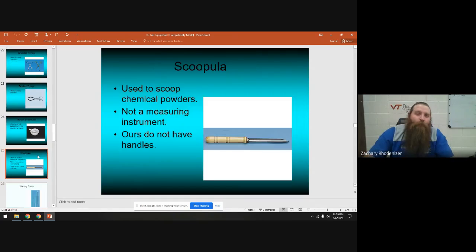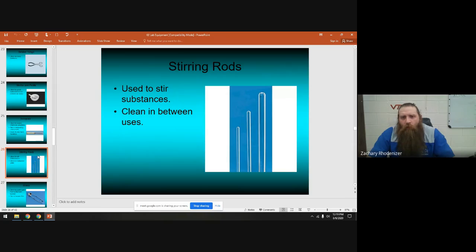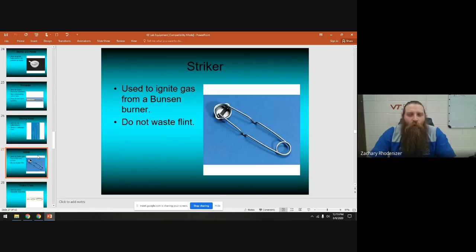This is called a spatula — most of ours are missing the wooden handles so they just look like metal scoops. You use them to get chemicals out of containers into a weigh boat. Everybody in their lab desk has glass stirring rods — you use them to stir things, which is a good name for them.